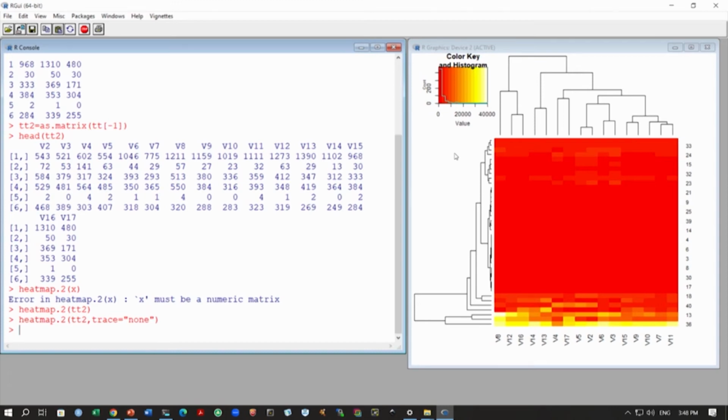So, to minimize that effect, what we do is something called scaling. Scaling will bring all the gene expression across samples to the same level, so all these genes will get similar weight in the clustering process. By clustering, we just want to see genes whose expression is very similar to each other across these samples.